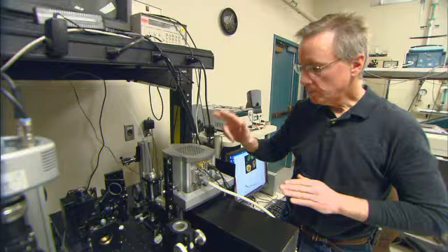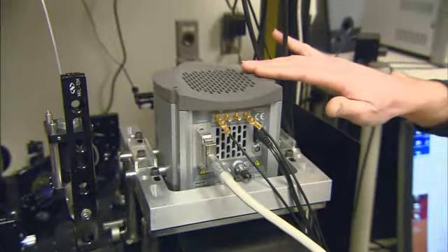We worked with the vendor for this CCD detector to develop a custom readout mode that's geared towards reading spectra, single line spectra.